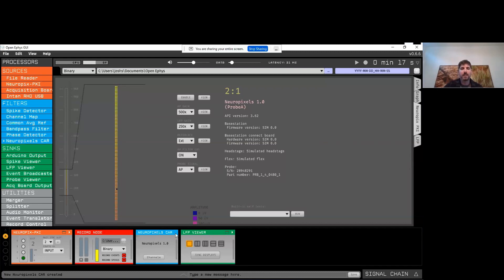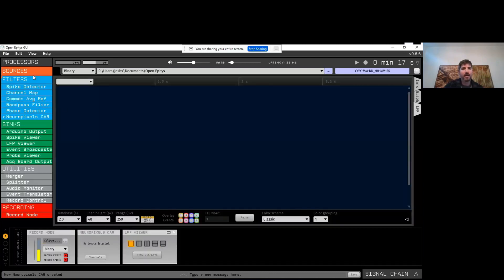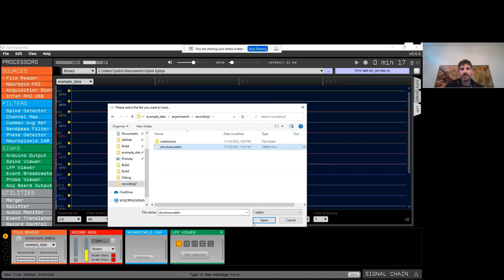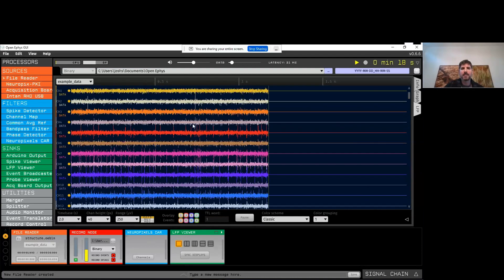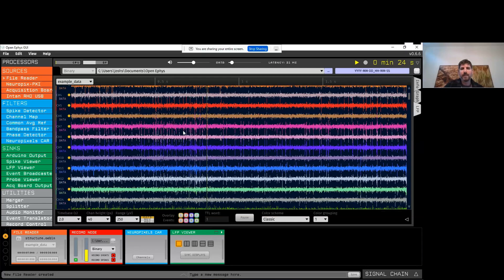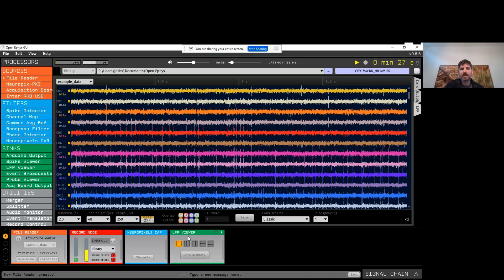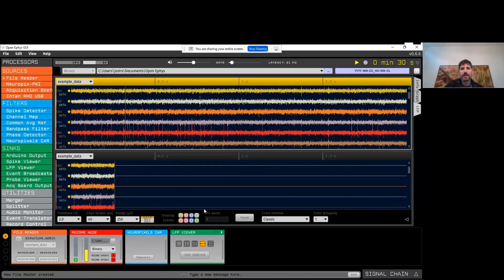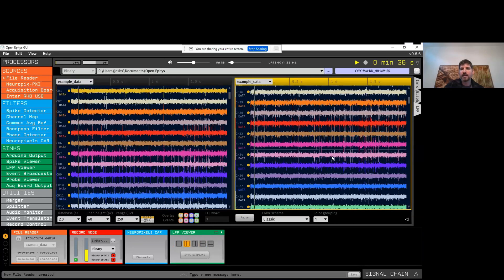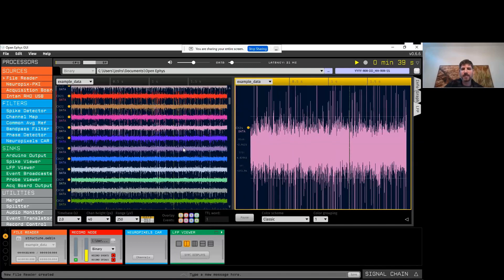If you're doing closed-loop feedback experiments, that's another reason to filter data online. Now I'm going to remove this plugin and add a file reader, then browse for some pre-recorded Neuropixels data. I can then see this pre-recorded data — 384 channels streaming in through the LFP viewer. We can modify this visualization in various ways: split the display vertically and scroll through different parts of the probe, or zoom in on a single channel while scrolling through the rest of the probe.